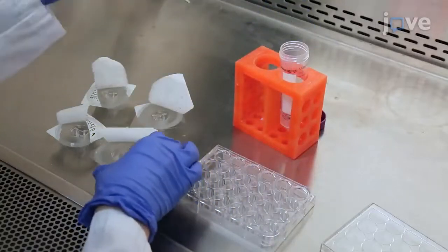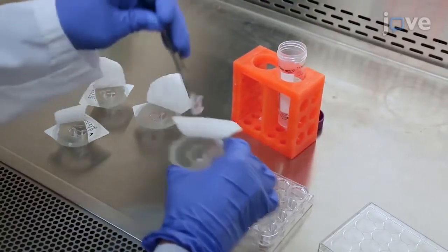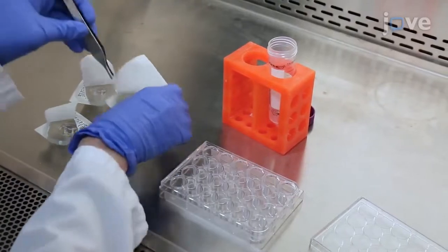To coat the transwell membranes, place the desired number of transwells in a 24-well plate, creating a two-chamber system.